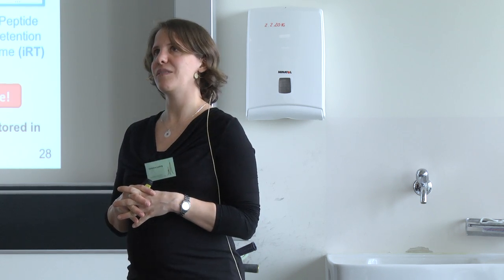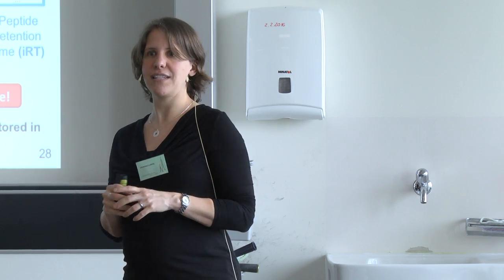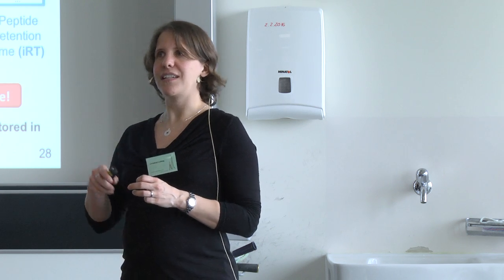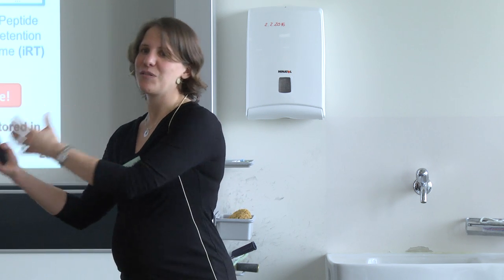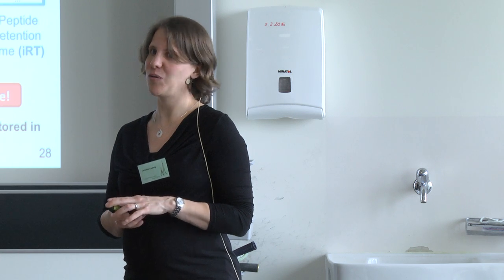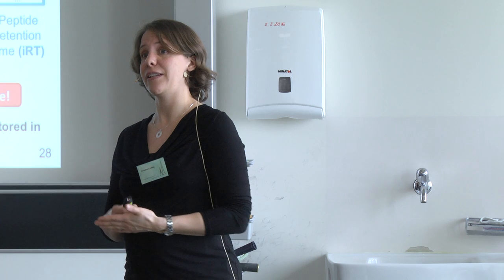we had these big projects ongoing where we ordered thousands and tens of thousands of synthetic peptides from companies, in a high throughput. And those ones that have never been detected before were also very poor. Then later on, when we had the optimal assay to still see it in the endogenous samples, was the one with the low success rate. Yeah. And you're also right, it completely depends on the background as well.